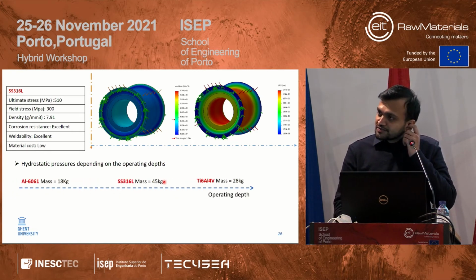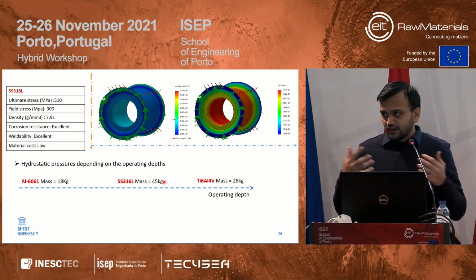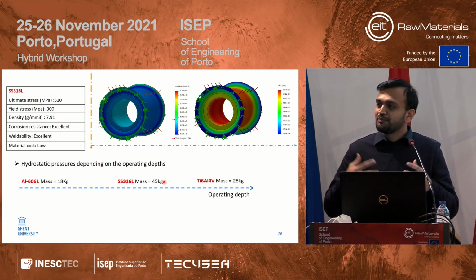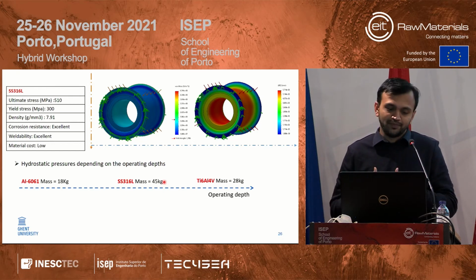As I already mentioned, when the operating depth increases, of course the dimensions are going to be bigger, and we need titanium or stainless steel materials based upon the operating depth.